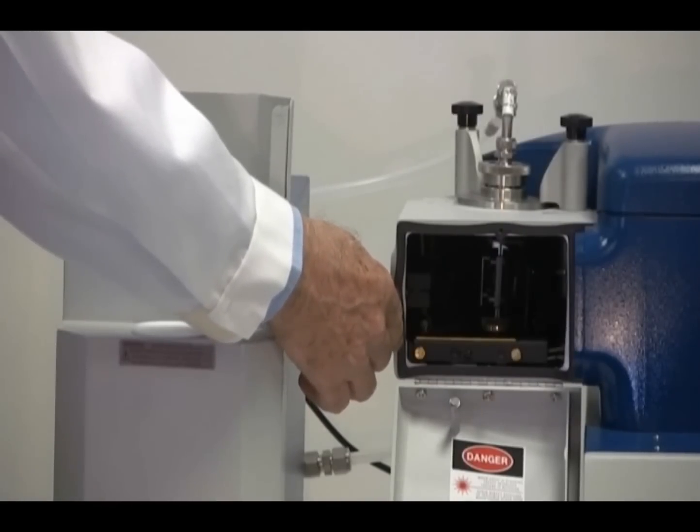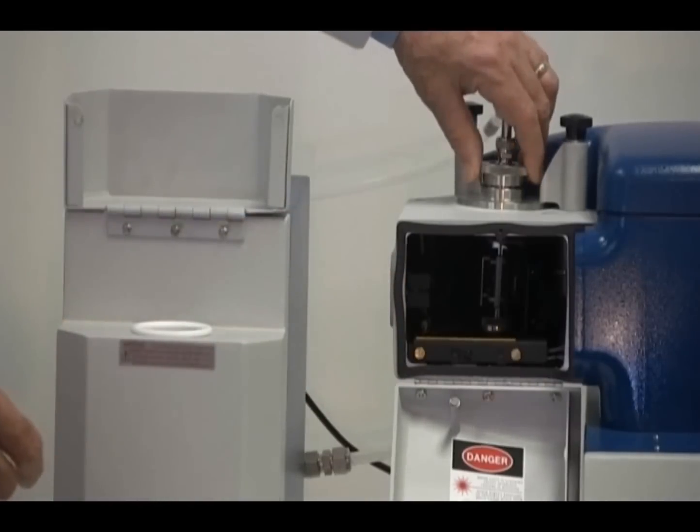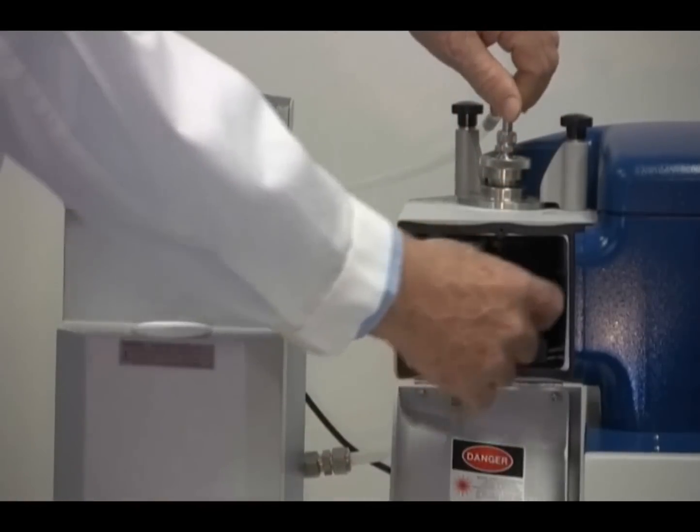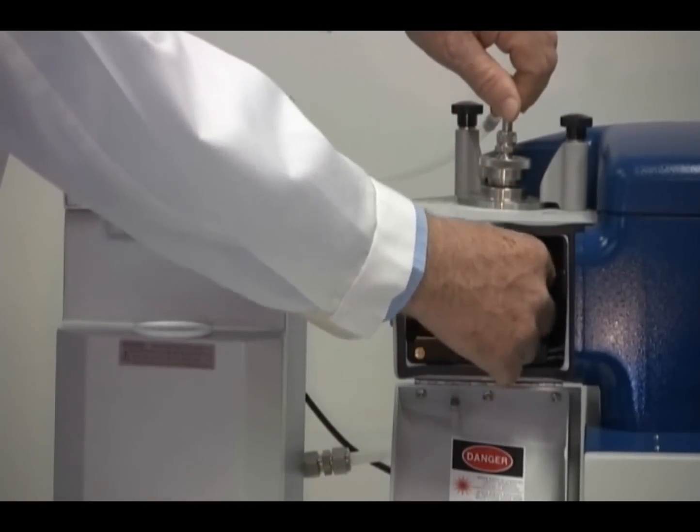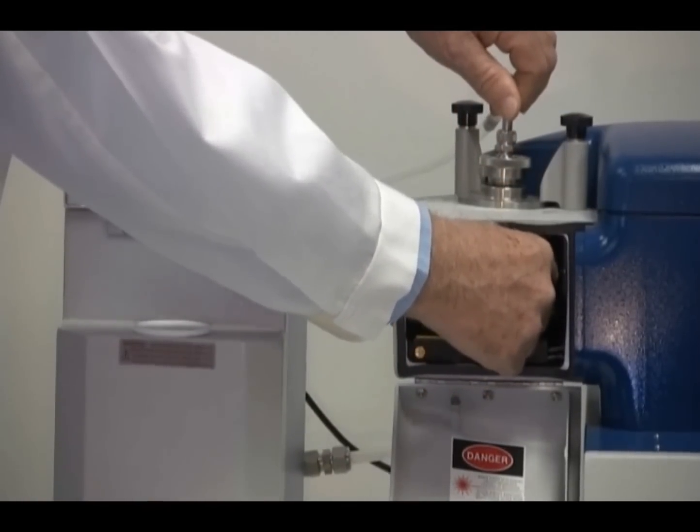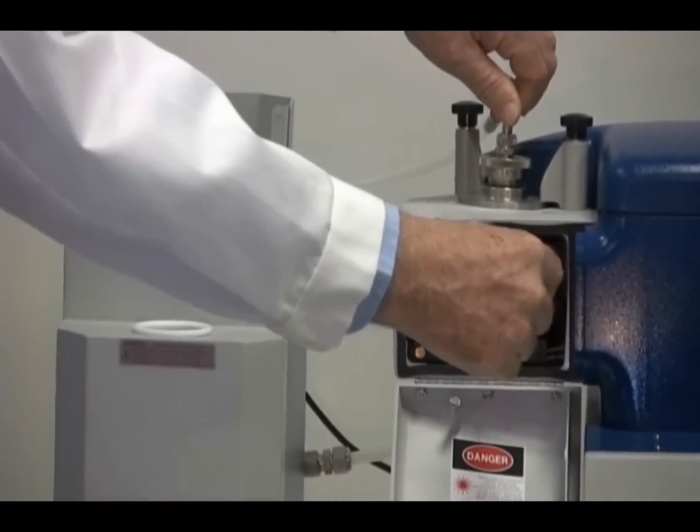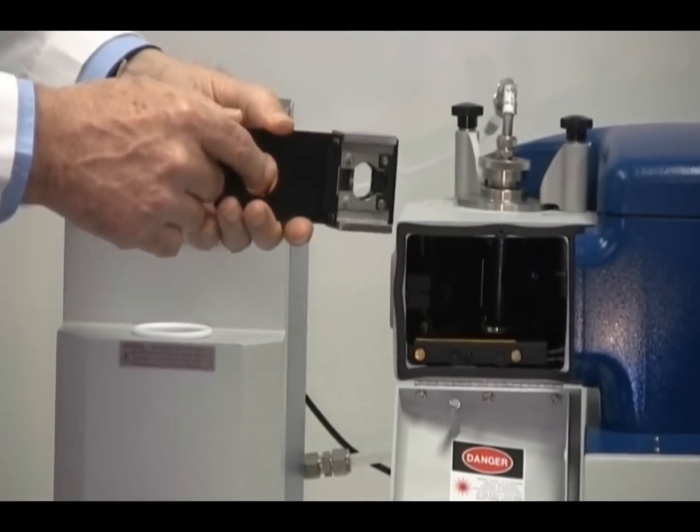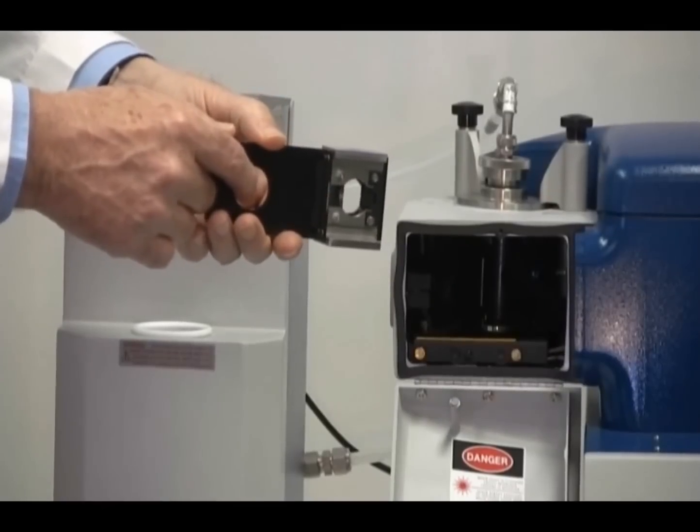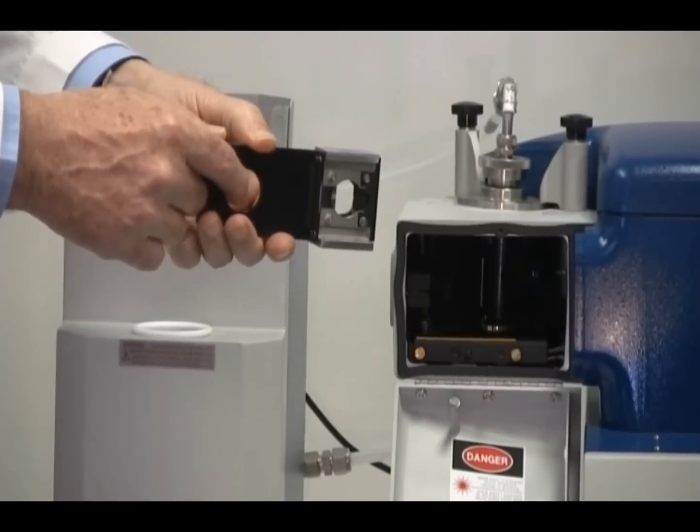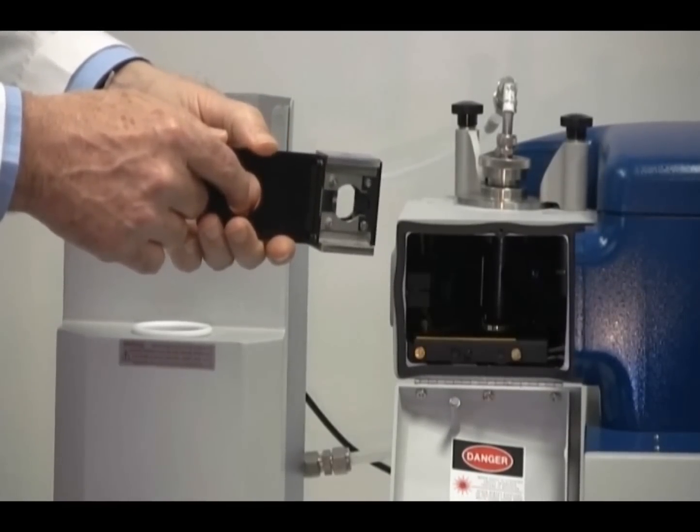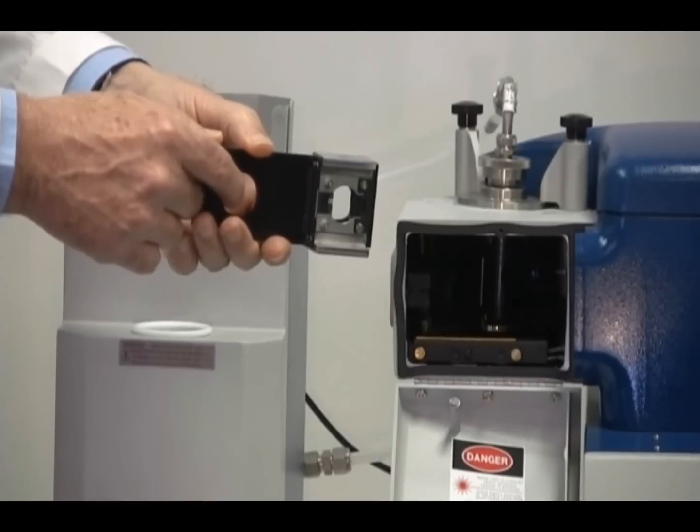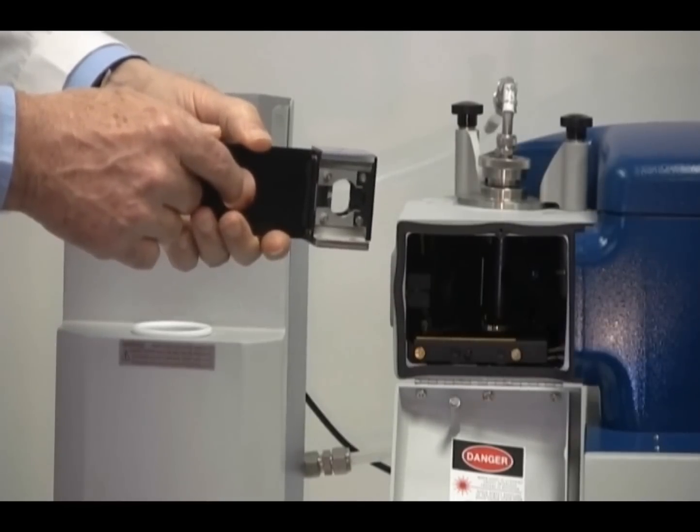To remove the sample cell, merely turn the knurled nut at the top counter-clockwise and lift up on the tubing. Grasp the cell holder by the handle and withdraw the sample cell. This is the sample cell that I will be cleaning. Unlike other manufacturers, there is no requirement to disassemble the cell to clean it. In fact, to do so would raise other problems, so make it a rule not to disassemble the sample cell.